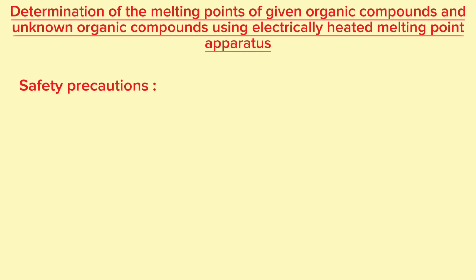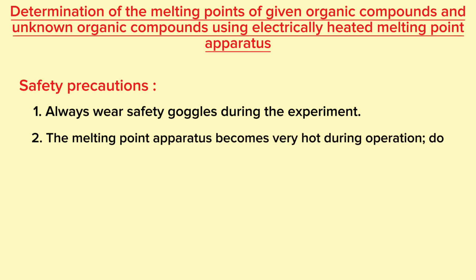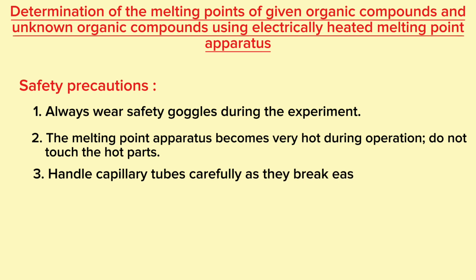Safety precautions. Always wear safety goggles during the experiment. The melting point apparatus becomes very hot during operation. Do not touch the hot parts. Handle capillary tubes carefully as they break easily. Wash hands properly after completing the experiment.